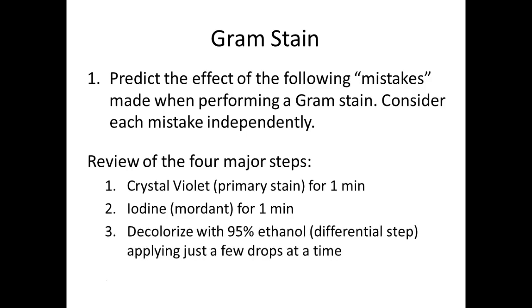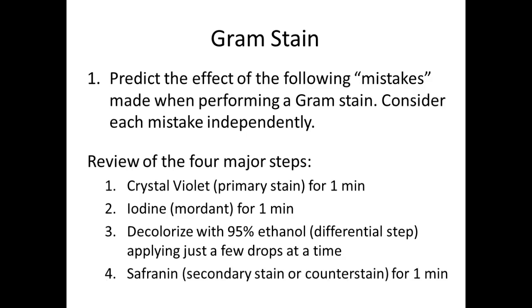We're going to do this drop-wise until the drops coming off go from a deep purple to a lighter purple. And I am going to demonstrate this, because this is the crucial step. If you decolorize too long, you can even remove it from your gram-positives. And then safranin, so we can see our gram-negatives, for 1 minute. Our secondary or counter stain.